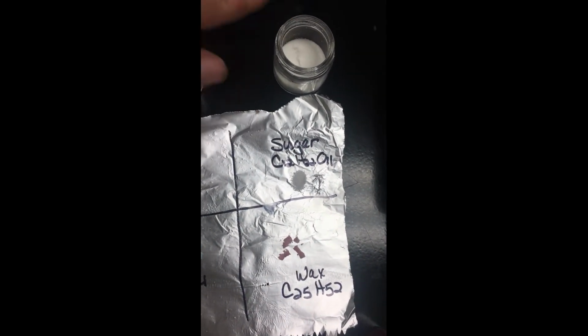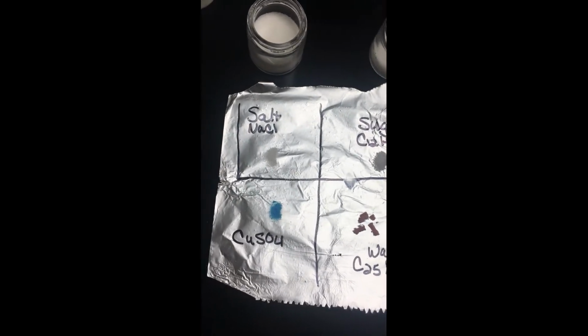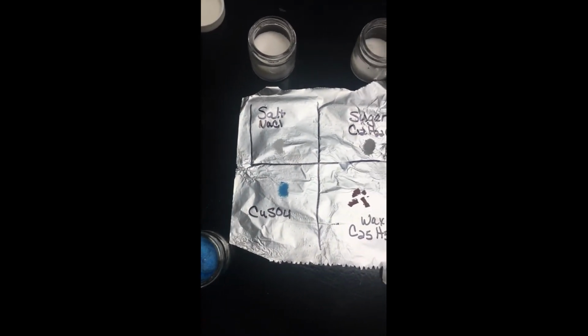In this lab, ionic and covalent properties, we're going to use the difference in properties between ionic compounds and covalent compounds to determine which is which. So our four substances are salt. This is table salt. It's white crystals. Our sugar, also white crystals. We have copper sulfate, blue crystals, and wax, paraffin wax, which I just scraped off a candle.